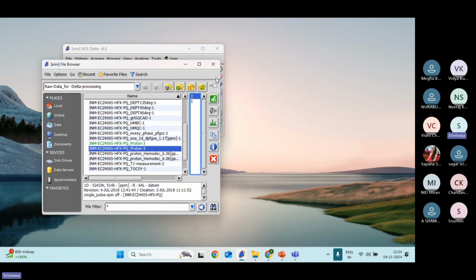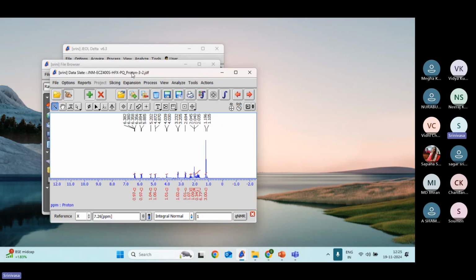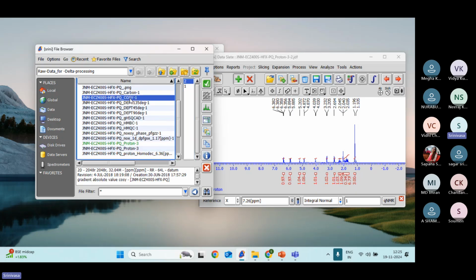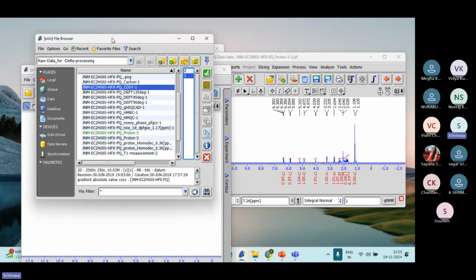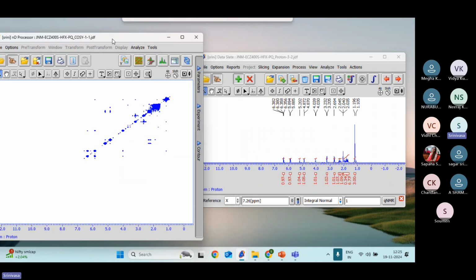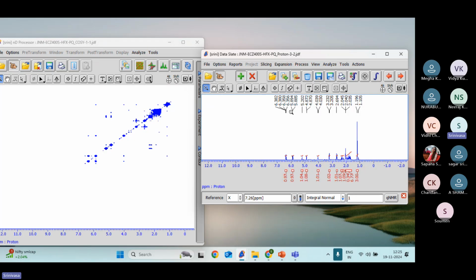And the pin indicates that this window will be active. Click and keep it aside. Then, for the COSY experiment, take the COSY here, and number 2 is selected as ppm. It means processing one. Number 1 is for the unprocessed data file. Now click. If you unpin this one, after opening the data, this window will be closed. Just see, this is closed. For COSY processing, open the processed proton spectra and open the unprocessed COSY data sets.